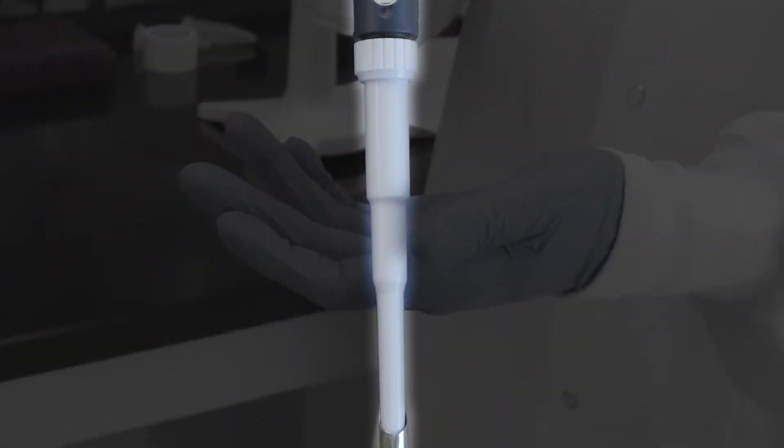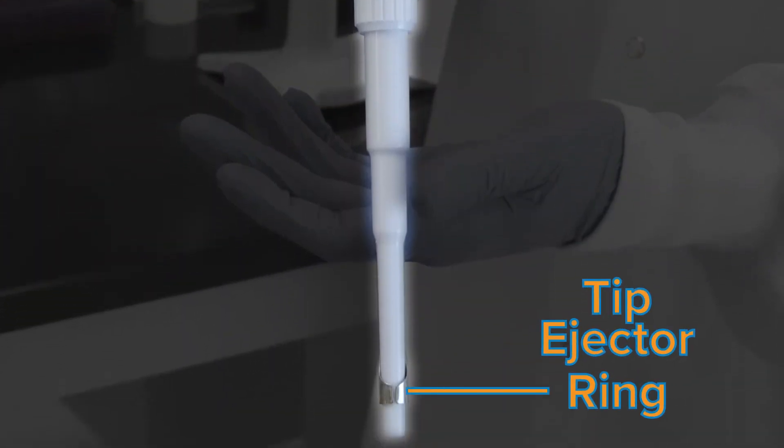Finally, we have the tip ejector ring. This pushes the pipette tip off the pipette, allowing you to quickly dispose of used tips. We'll also explain why that's important in a bit.